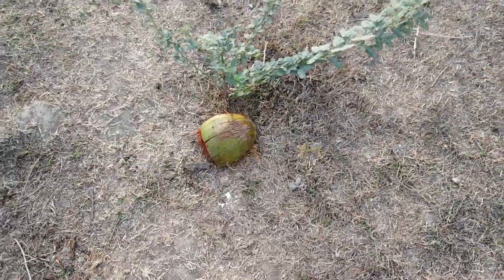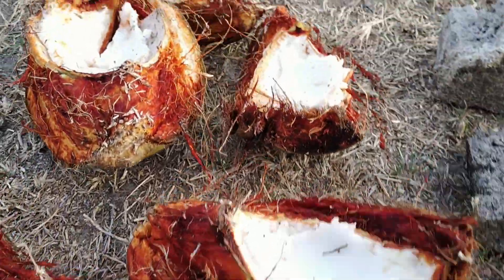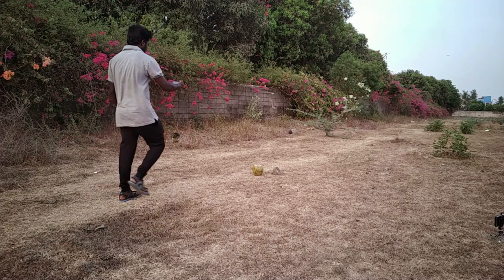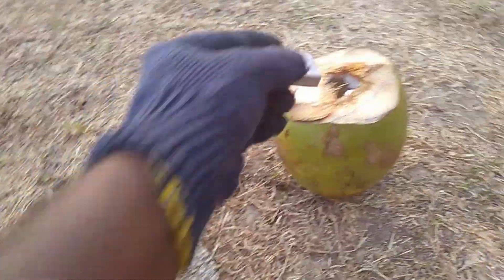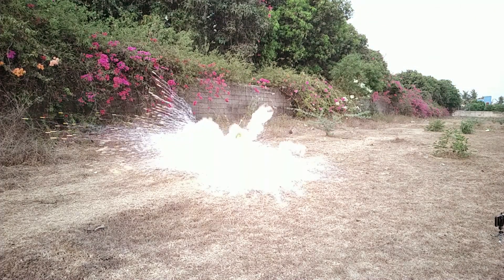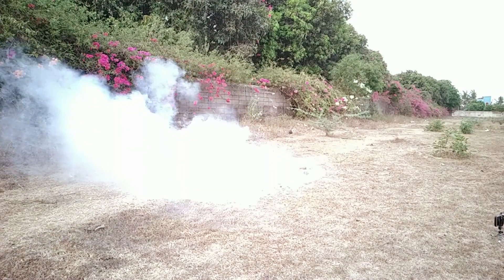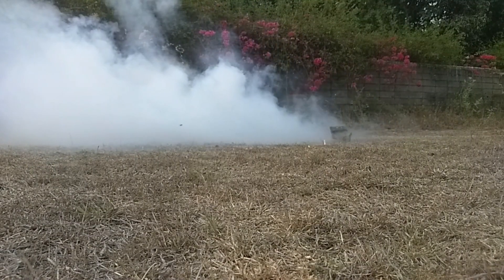The next piece is made of cement. This is a dangerous experiment. Put a piece of sodium and put it in the pot. Try this experiment and see how many different results you get.